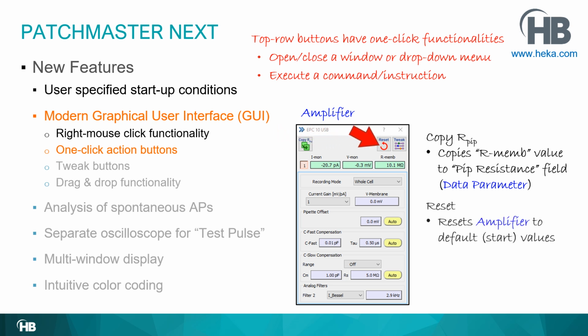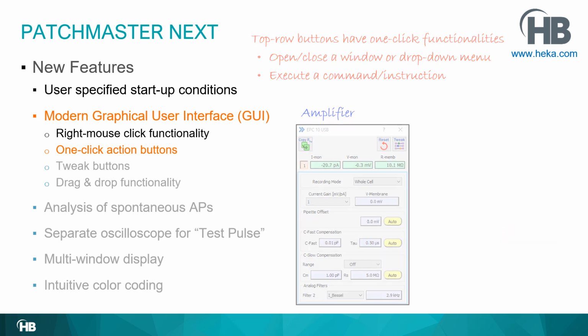Then there's this reset button, another very helpful button, because when you want to start a new recording, you simply press this button to reset the amplifier to its start values, and then you can patch the next cell.